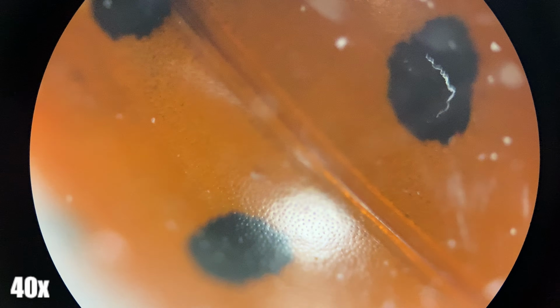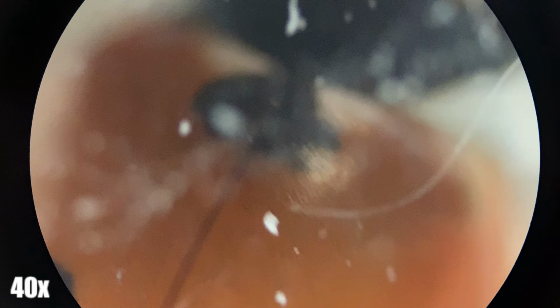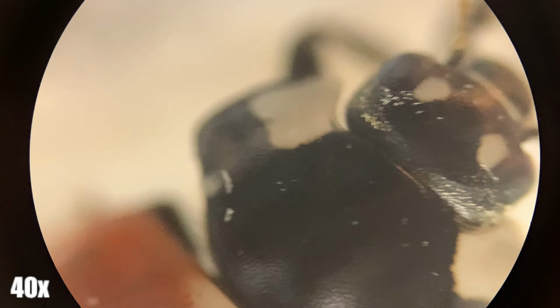One interesting thing that I've seen on many of my insect specimens is the presence of hooked feet, and these microscopic structures are exactly how that creepy crawly is able to stay attached to your skin or shirt once landed, and why they're able to crawl on walls and sometimes ceilings.